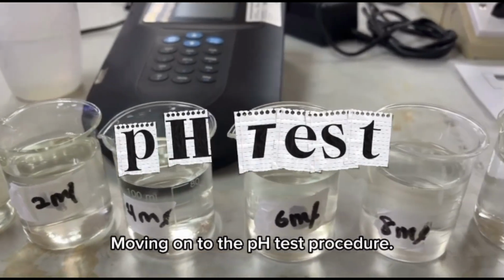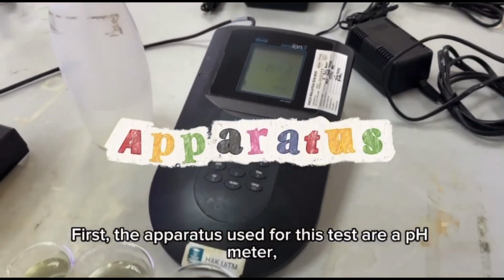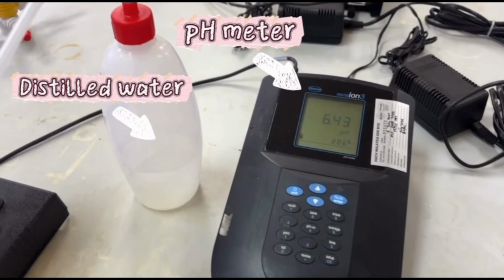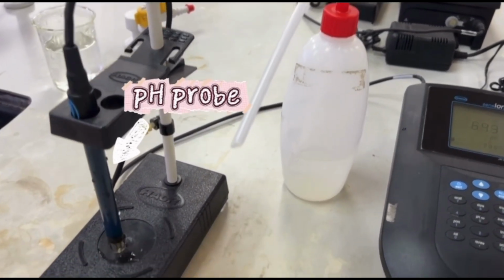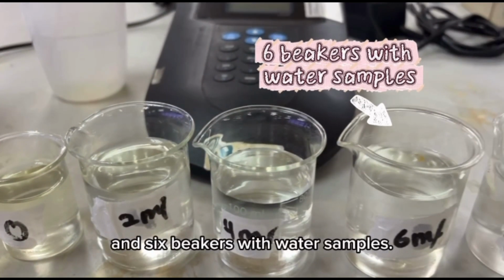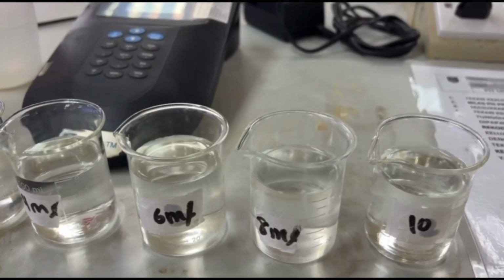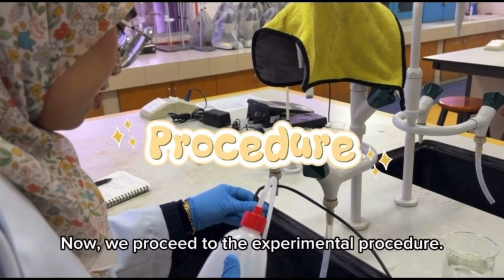Moving on to the pH test procedure. First, the apparatus used for this test are a pH meter, distilled water, and 6 beakers with water samples. Now, we proceed to the experimental procedure.